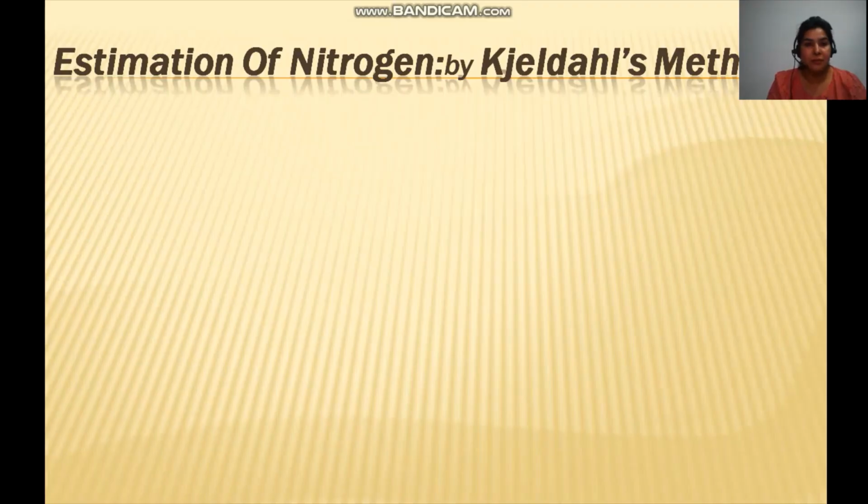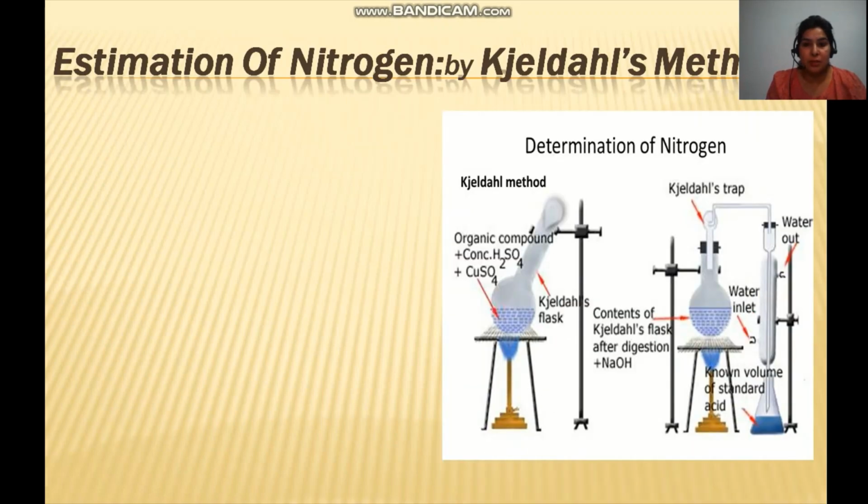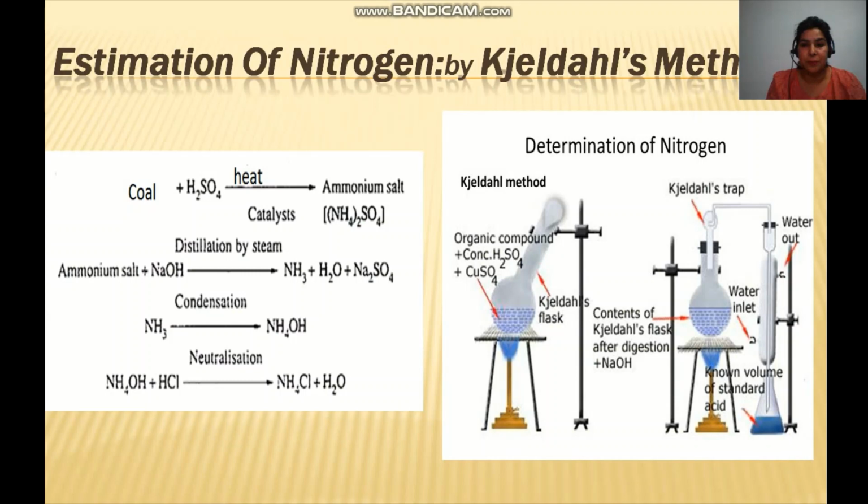Hello everyone. In this video we are going to discuss the estimation of nitrogen by the Kjeldahl method. Let's try to understand this method through this diagram and the reactions involved.